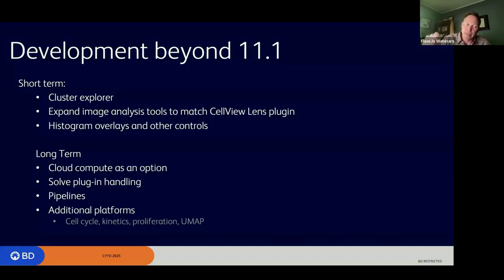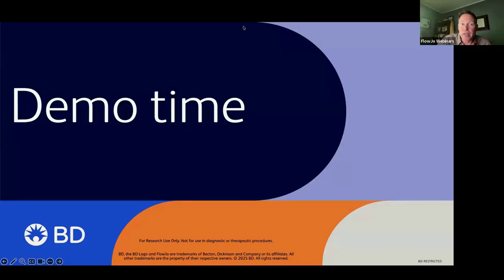All right. And at this point, I'm going to demo unless there's anything in the chat. Let me peek at questions. Nope. Or the Q&A. Also good. So, all right, let's just demo.